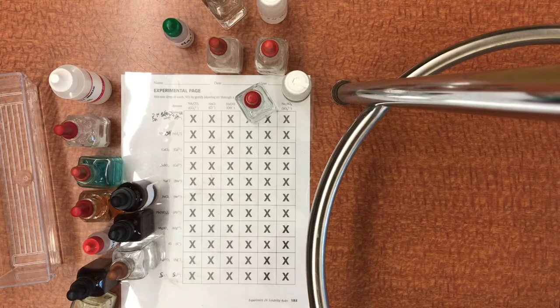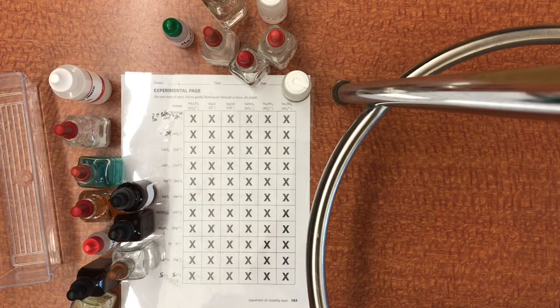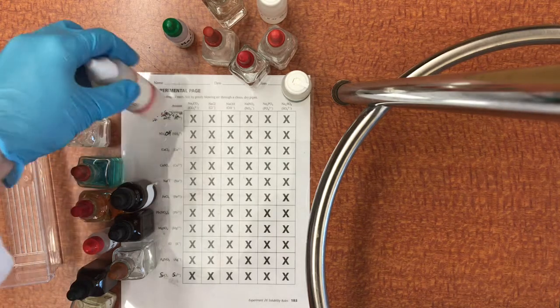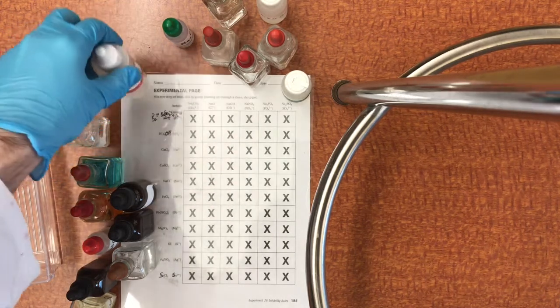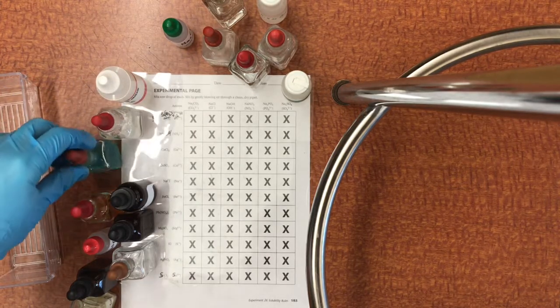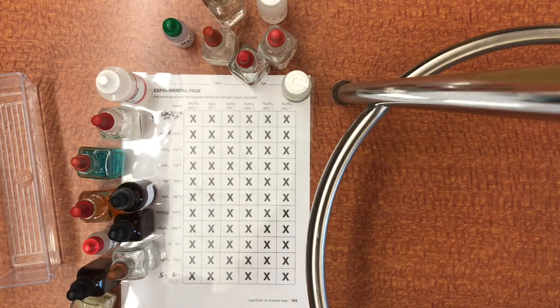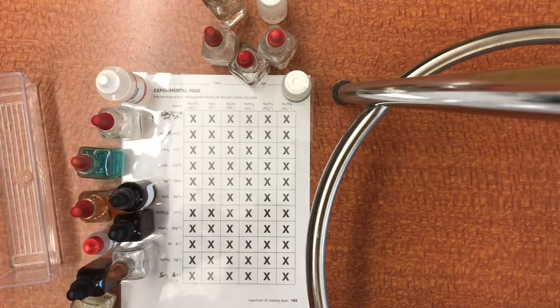Hello everyone, so today we are going to be doing a small demonstration of the solubility rules. What I have here is a bunch of solutions like barium nitrate, ammonium hydroxide, calcium chloride, etc. And I have them arranged in a little table, and what I'm going to do is take a drop of each and add them together and see what happens.